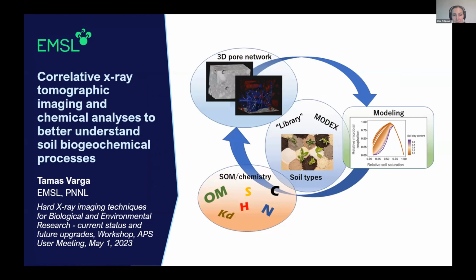He is interested in applying X-ray techniques like imaging, spectroscopy and diffraction to investigate biogeochemical transformations that happen in the environment, especially in the soil. He'll be talking about correlative X-ray tomographic imaging and chemical analysis to better understand soil biogeochemical processes. Thank you, Tamas. Please go ahead.